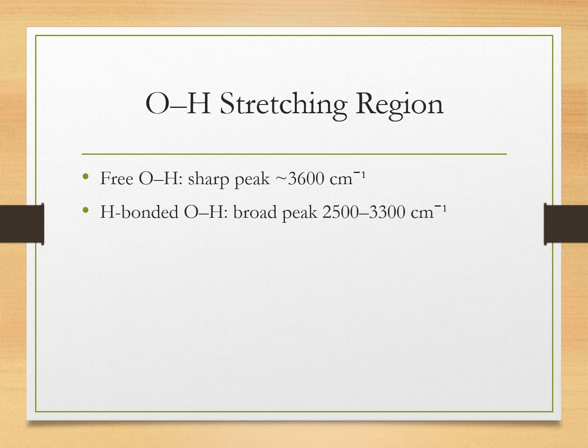In this case, two cases will be discussed. If a free OH bond is present, the free OH stretch will appear as a sharp peak at about 3600 per centimeter.